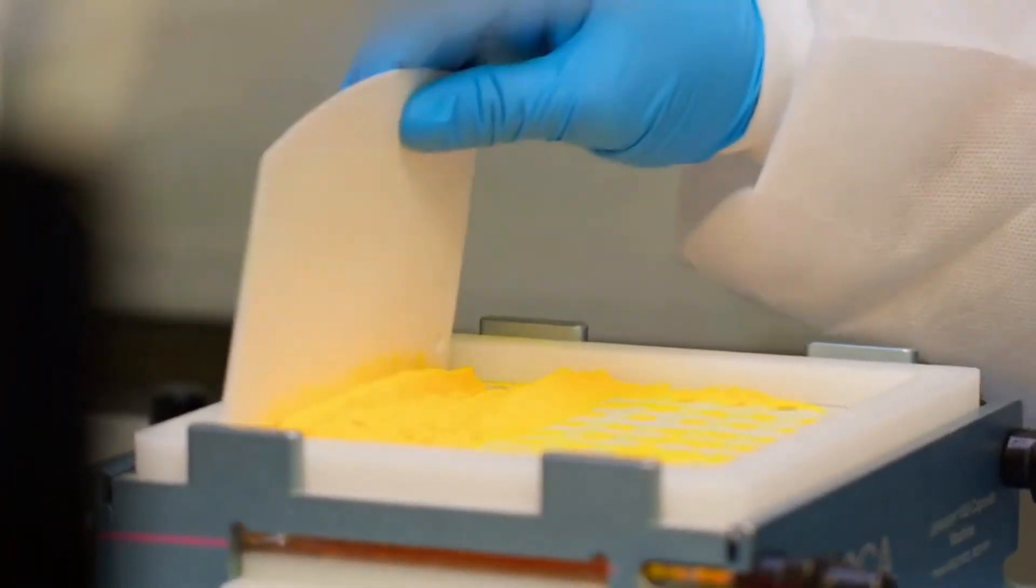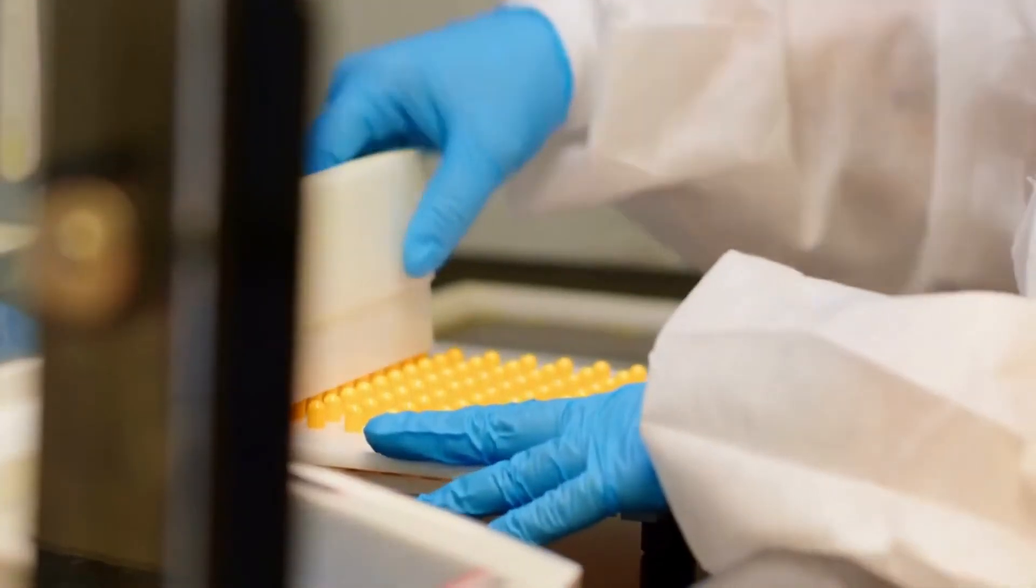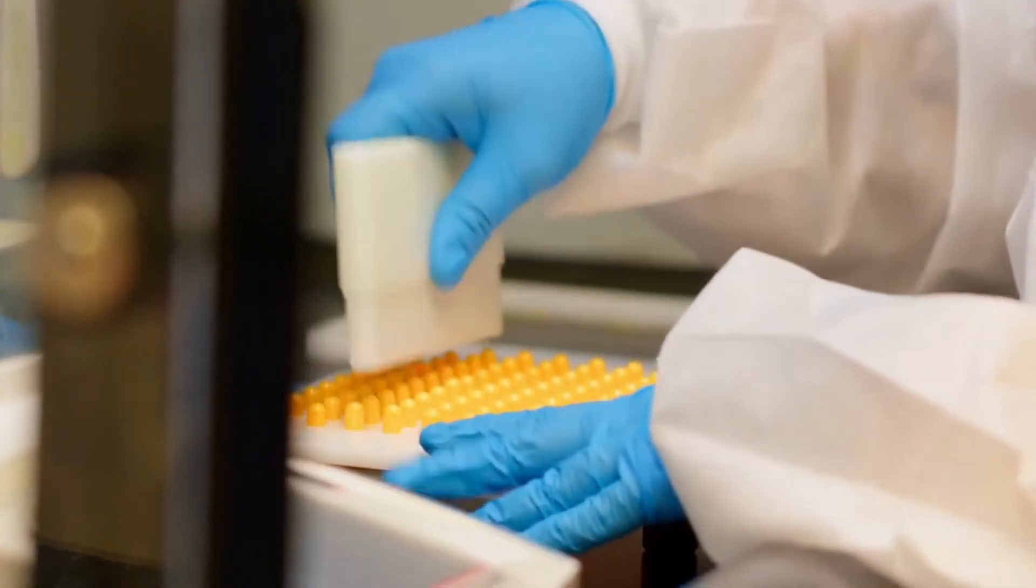We have recently invested well over a million dollars in a new state-of-the-art compounding facility. Our high-tech labs enable us to compound medication to the highest standard in our industry, and our rigorous protocols lead to excellent patient outcomes.